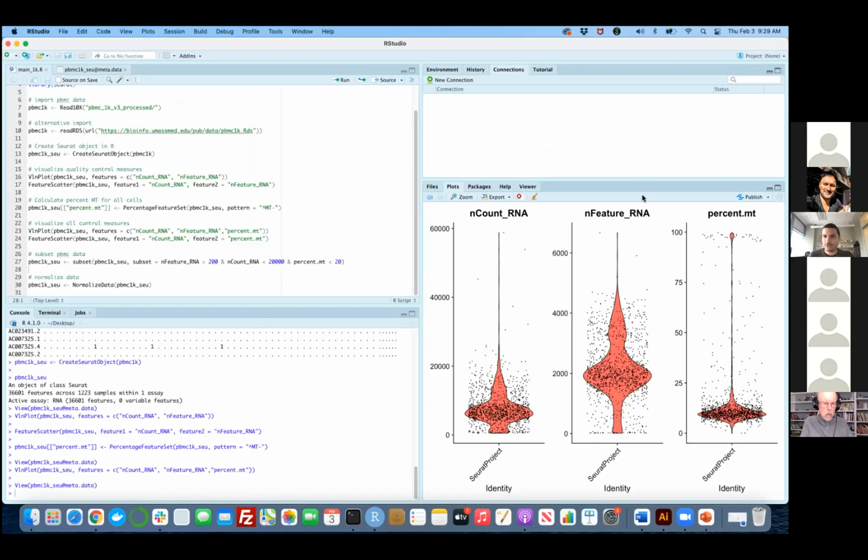Is there any right threshold for nCount and nFeature? It's very hard to find out whether these numbers are real or artifact. It's a really good question. It's a trial and error process. Most of the time, when you have a really low UMI threshold, you may start seeing some clusters that do not have any unique markers specific to them, indicating their phenotype or cell type. That may give you a hint that you should increase your UMI threshold.